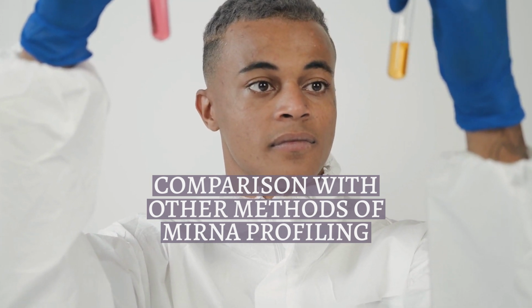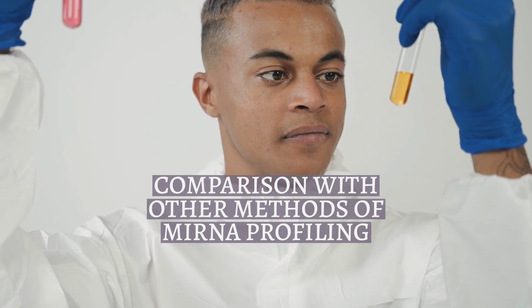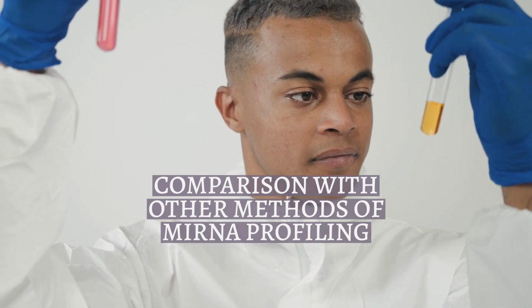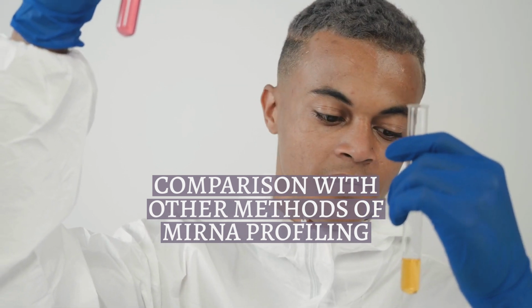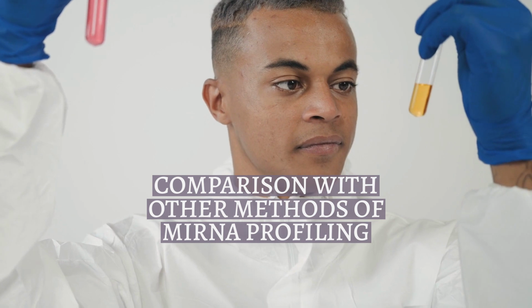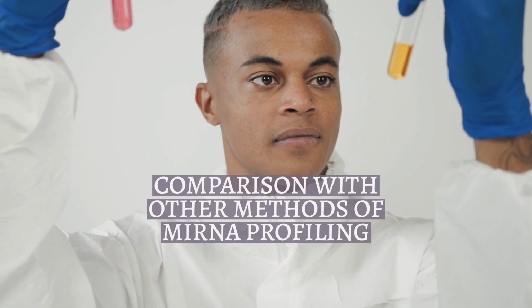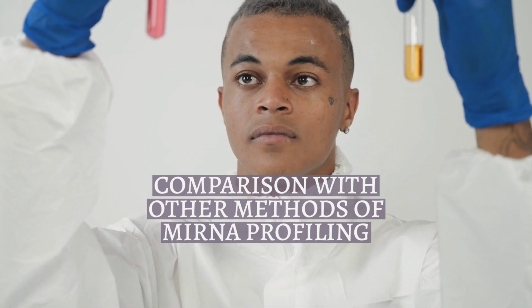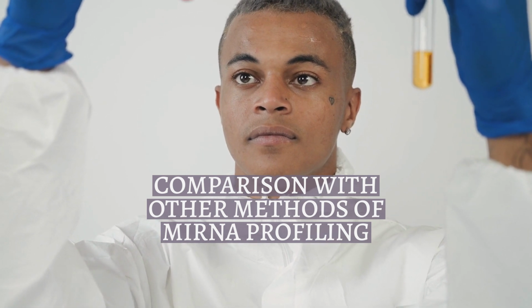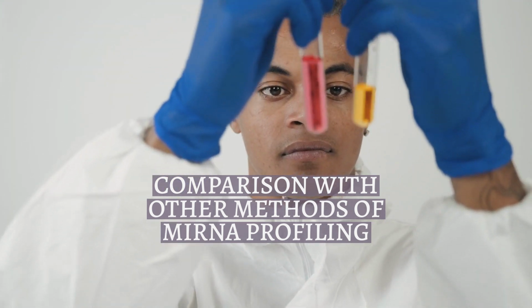As well, miRNA-seq library preparation methods seem to have systematic preferential representation of the miRNA complement, and this prevents accurate determination of miRNA abundance. At the same time, the approach is hybridization independent and therefore does not require a priori sequence information. Because of this, one can obtain sequences of novel miRNAs and miRNA isomers, distinguish sequentially similar miRNAs, and identify point mutations.